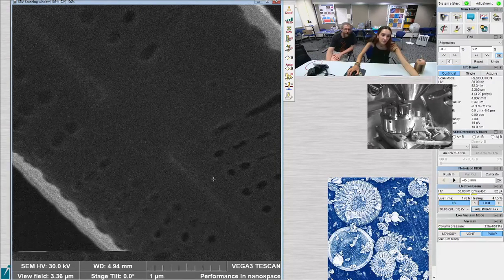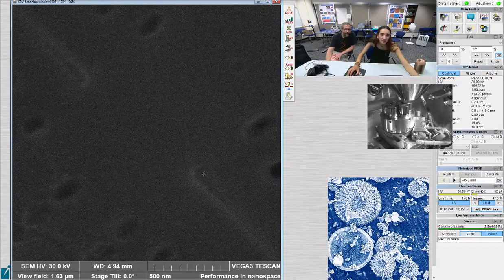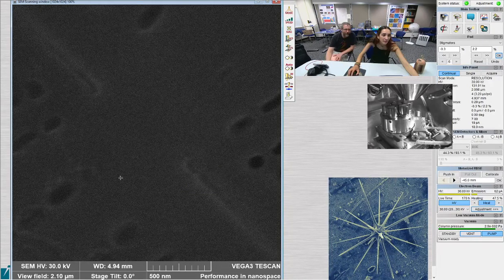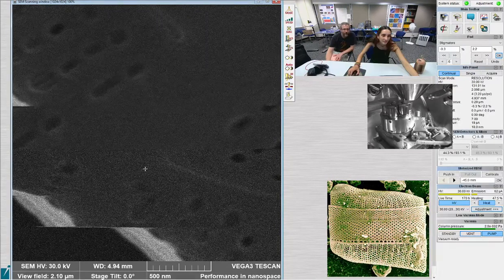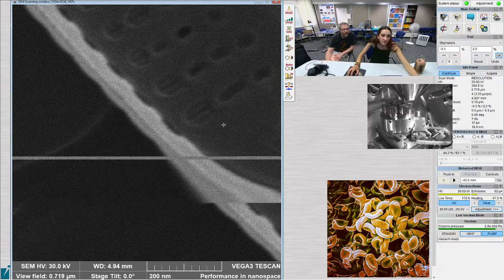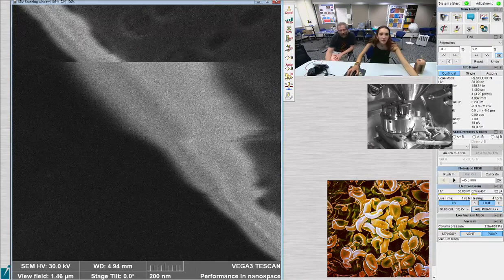I would pick something that has a sharp edge that you can focus on. I tried on the raphe, but it looked uglier after. So the little pores that have the mouth on them? The next one over. This one? No, towards the wall, towards the margin. Those ones. They have a little pore covering on them? Yeah, any of those. That's what you want to have in focus. Those are super interesting, anyway.